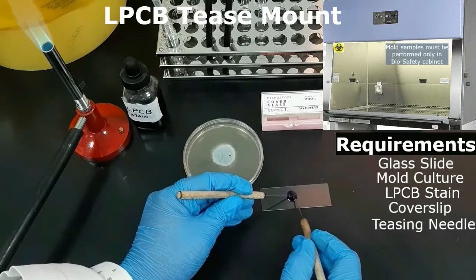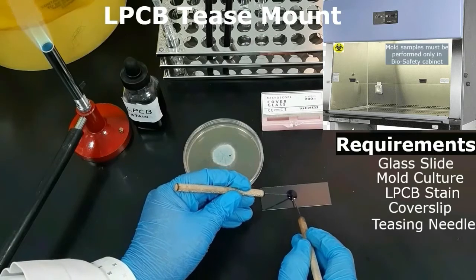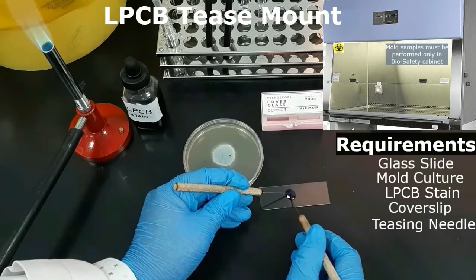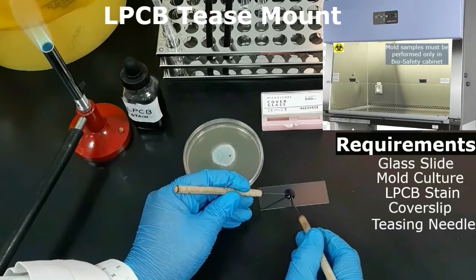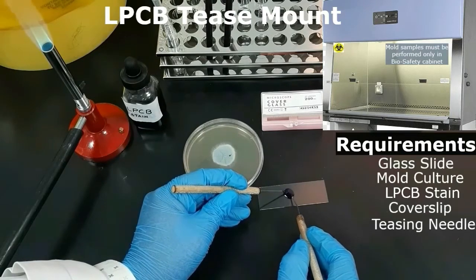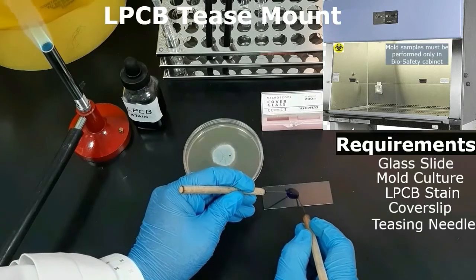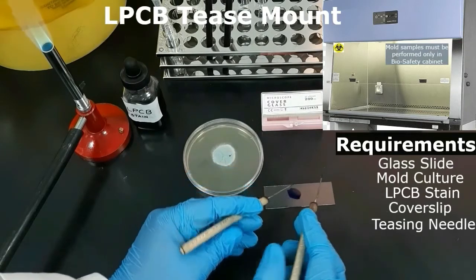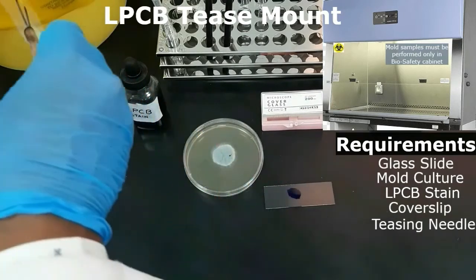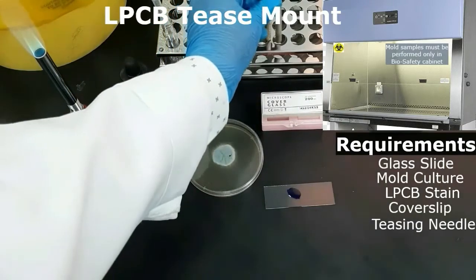With the help of two sterile teasing needles, gently tease apart the fungal mass. Continue to tease the fungal material until it is well separated. Then sterilize the needles and place a cover slip over the teased material.